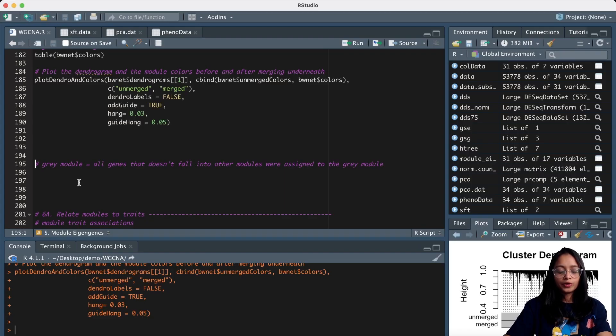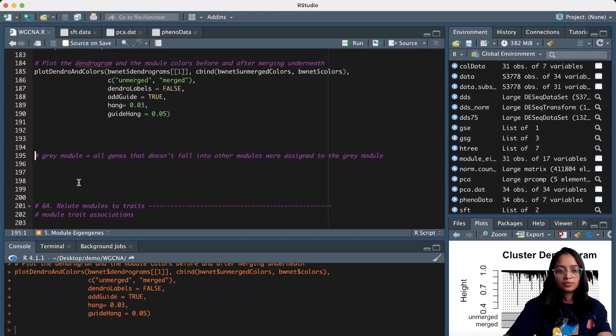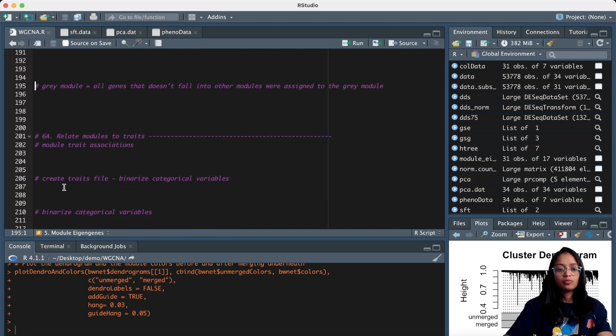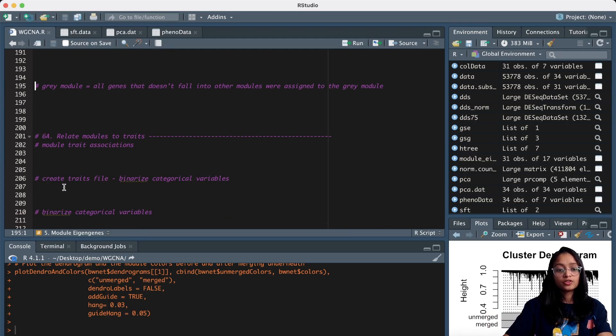Now that we have identified modules and merged similar modules, next we need to relate the modules to traits. So we need to find which of the modules have significant association with the trait of interest.